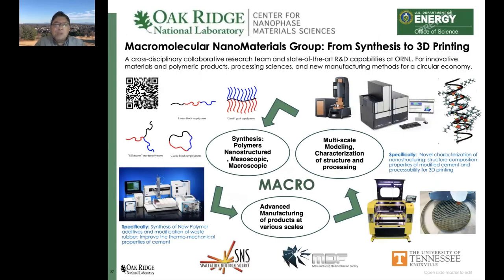So part of my responsibility now with Oak Ridge National Laboratory is that I'm a group leader of the CNMS, the Macromolecular Nanomaterials Group. We focus on synthesis of polymers, deuterated material, probe materials, development of techniques, state-of-the-art characterization methods, simulation. And in fact, when I joined the national lab, I introduced and developed two laboratory capabilities. One that involves 3D printing with 5, 6 different 3D printing methods, and a laboratory that's focused on machine learning directed synthesis.